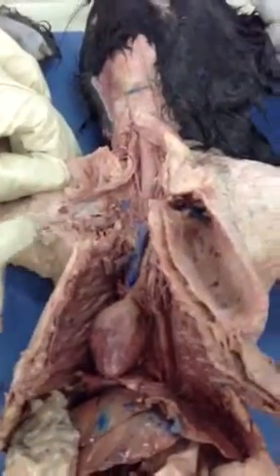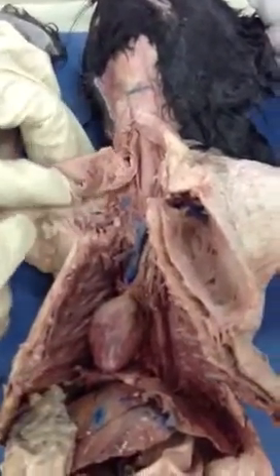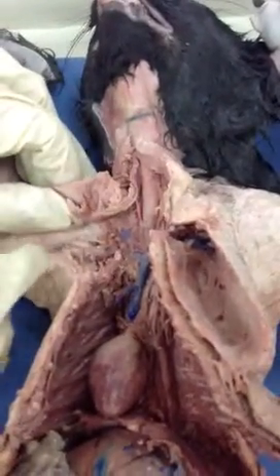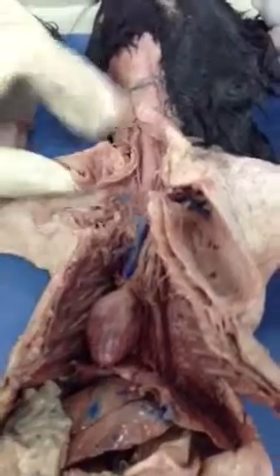I continue my journey, and then this blood vessel goes into the arm, and it's going to change name like streets, right? Brachial artery. Brachial artery. Very good.